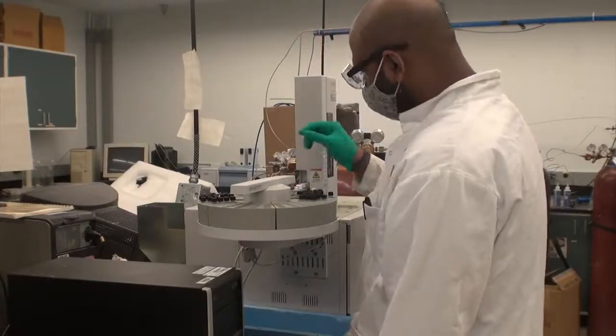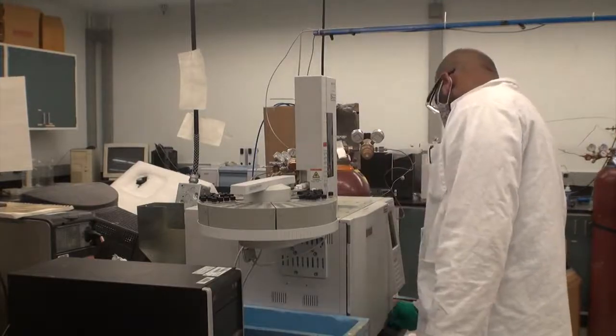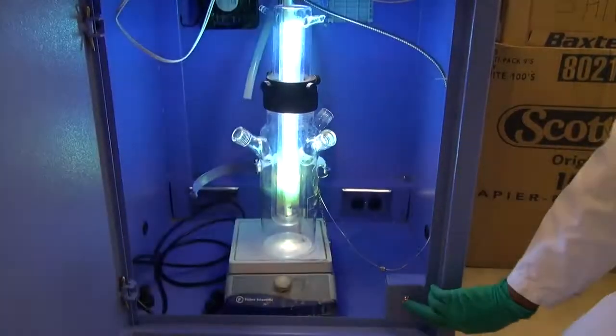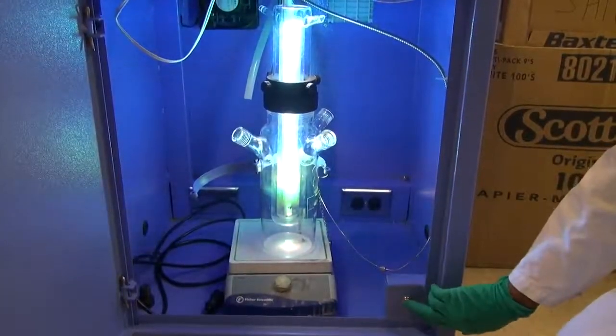My process uses a UV lamp source and catalyst, typical photocatalysis, which gets excited by UV light and reacts with methane to form oxygenated hydrocarbon fuels.